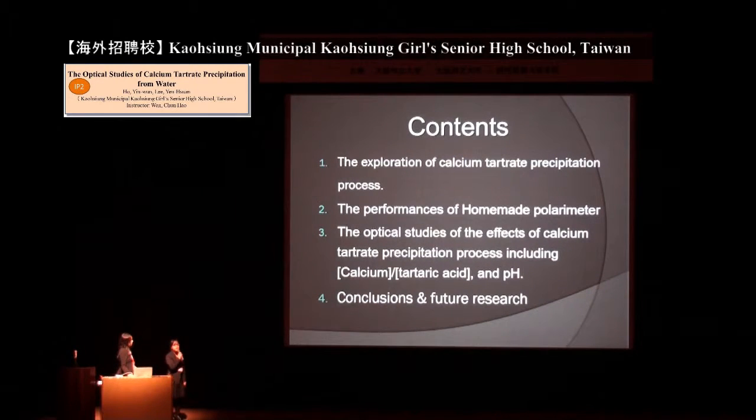The research is divided into two parts. In the first part, we took advantage of spectroscope and Tyndall effects, exploring the calcium tartrate precipitation process. In addition to the effect of different concentrations or pH values of calcium ions, we dug into the reaction between calcium ions and carbonates or hydroxide, which are optically inactive.